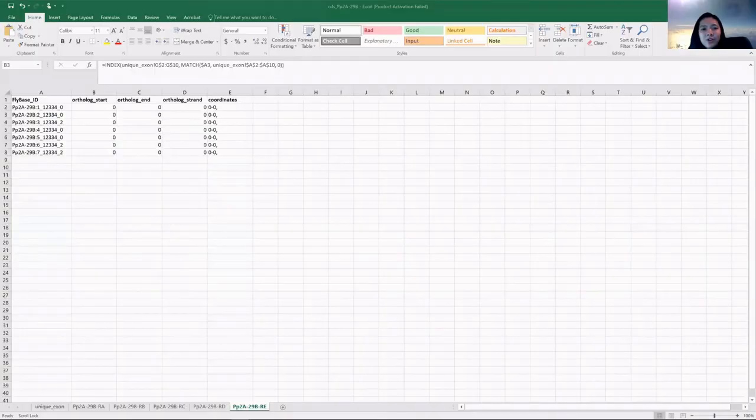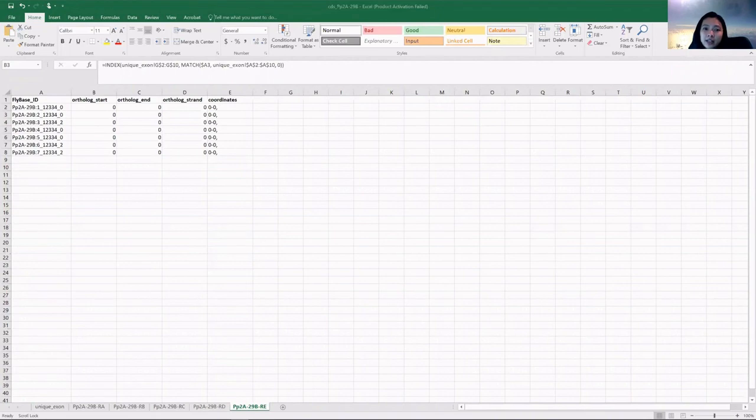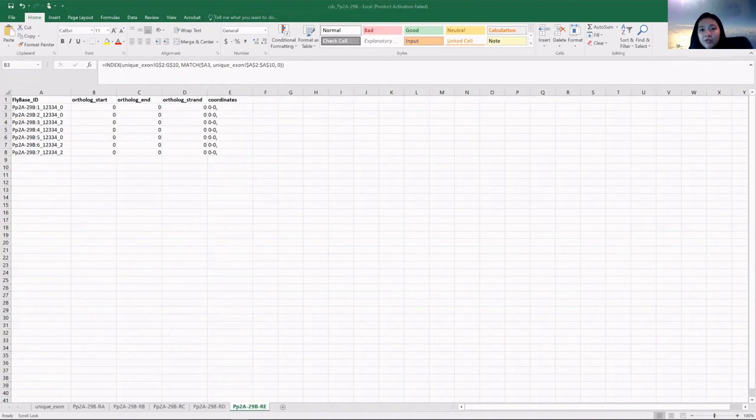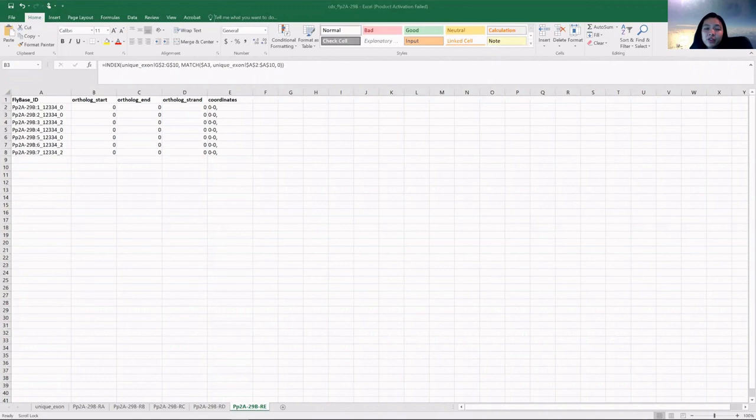When you open the spreadsheet, you'll see a template table for each isoform with its CDS identifier. This table is useful to keep track of your annotation coordinates while determining the approximate location of the coding exons in your target species.